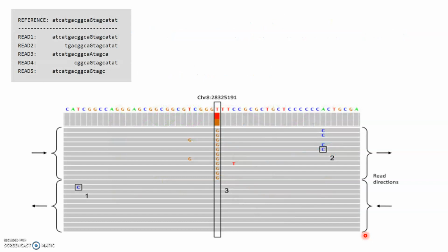Remember that we were visualizing using the web-based version of the IGV tool, the Integrative Genomics Viewer. If you didn't complete that exercise with SNPs 1, 2, and 3, go back to that individual lecture and go ahead and finish up those questions.